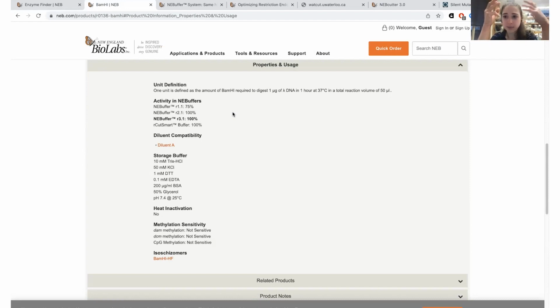I've also seen other potential benefits, like the BSA binding proteases and other things so they don't have weird activity on various components, just kind of keeping things happy. But so it used to be that you would have a buffer like 3, and then you would add BSA to it.